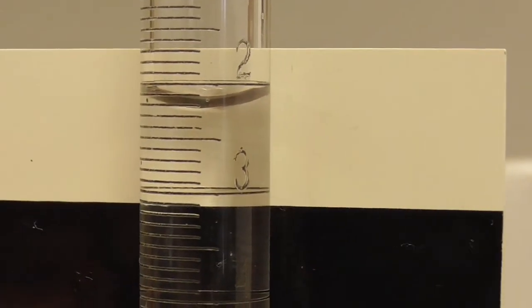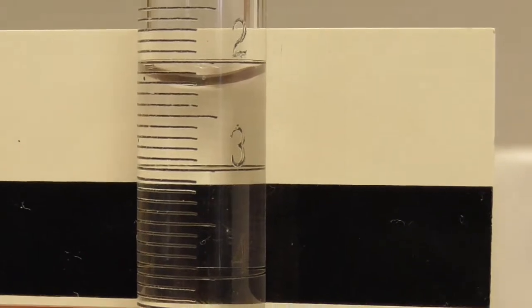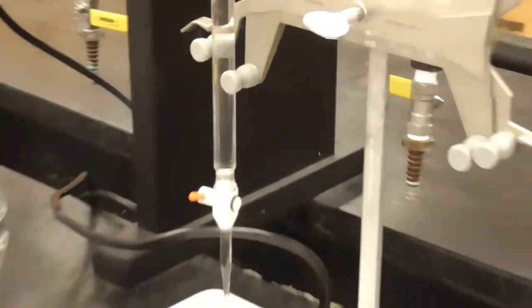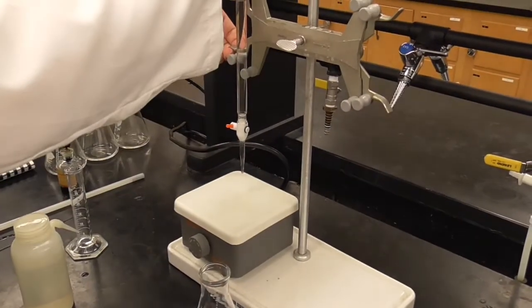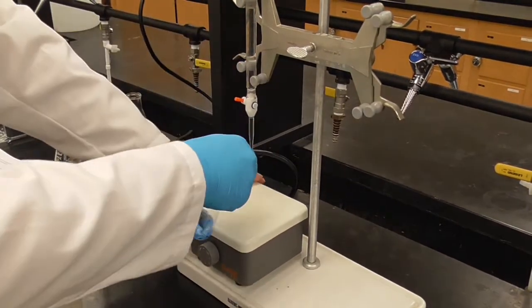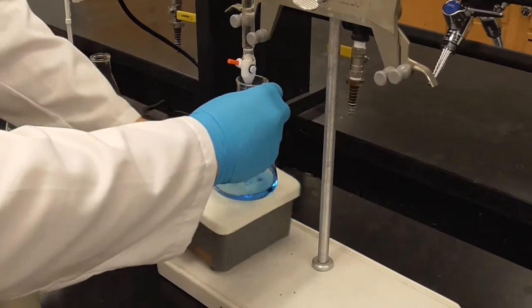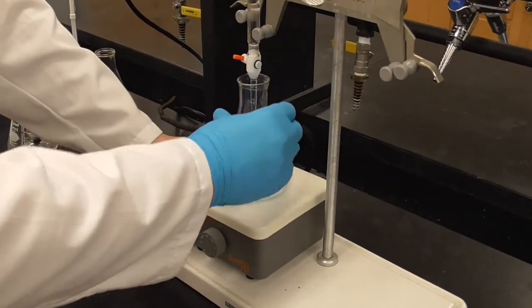Okay, so hopefully you can read off that value. That's your initial volume of HCl for the first sample. All right, raise this up a little bit higher.